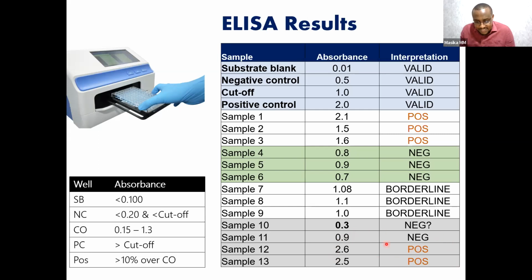And yeah, there are others here that are negative and clearly positive. So that's how you interpret. Now, do not cram these values on the right, this absorbance. It's going to change for every kit. This is just to walk you through what you do so that you remember.